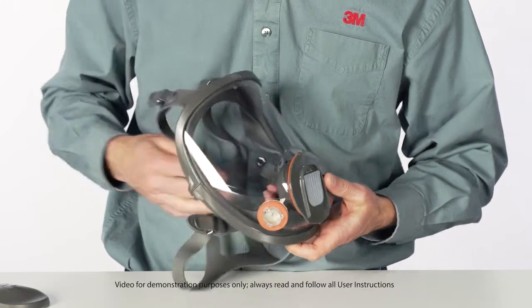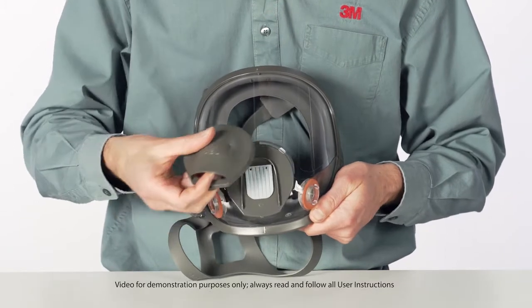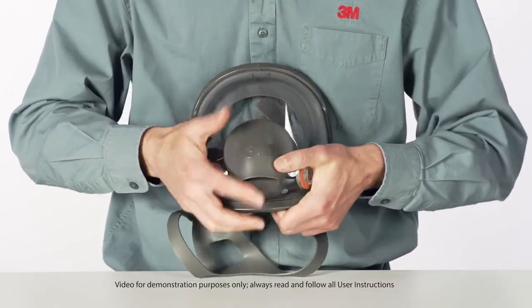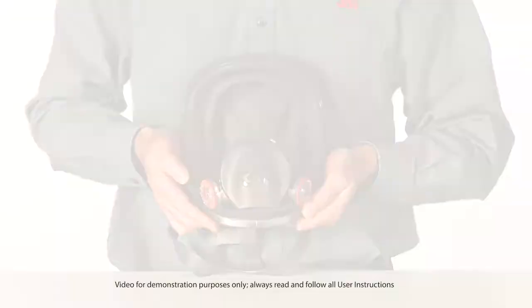Replace the valve cover by aligning the top opening of the valve cover with the top tab on the center adapter. Rotate the cover down until it snaps to the center adapter. An audible click should be heard. Note: conduct a negative pressure user seal check to ensure the exhalation valve is functioning properly.